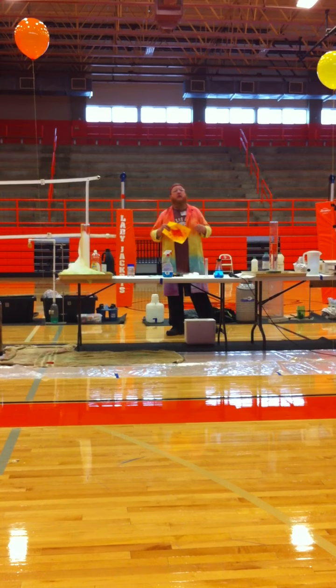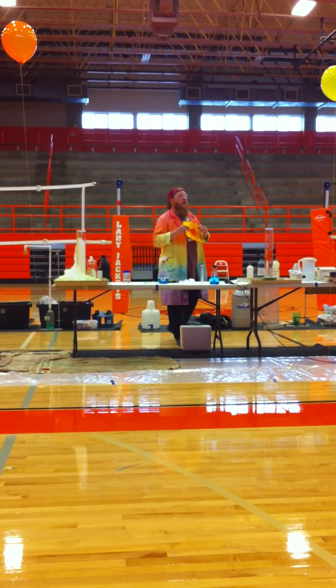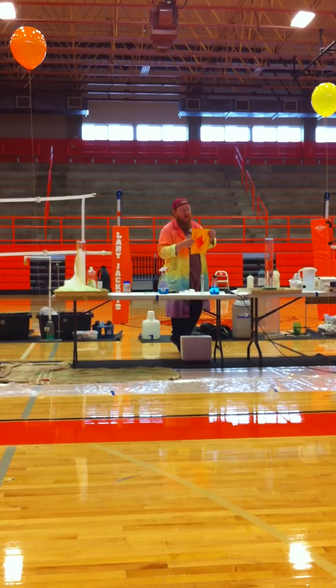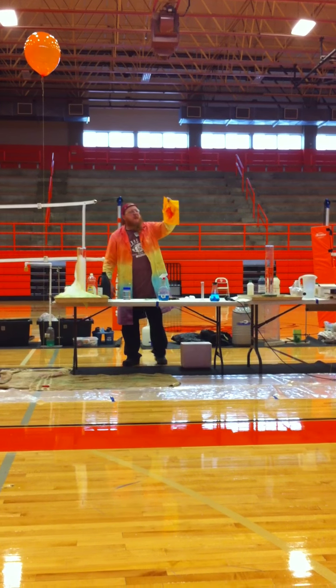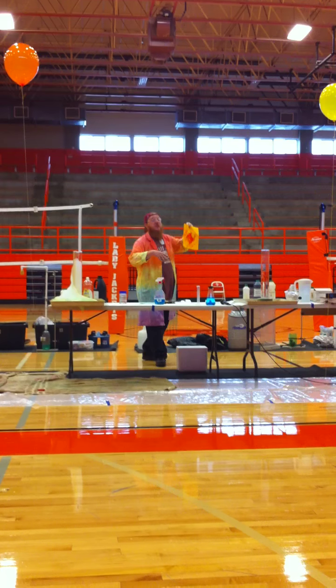Most of the original indicators were flowers, leaves, roots, parts of plants that change color with acidity and basicity. So turmeric is a nice bright yellow color. They use it to make food nice yellow colored in Indian cooking and things. But under basic conditions, it turns bright blood red. Is it staying red though? No, it's starting to fade because the ammonia is evaporating. And so it's going to go back to orange.